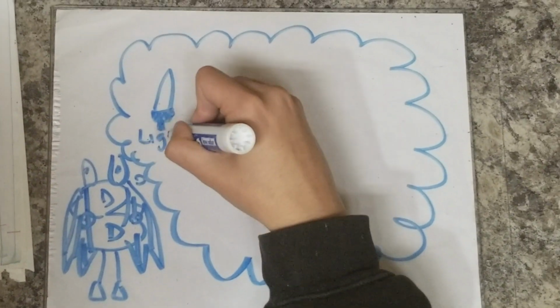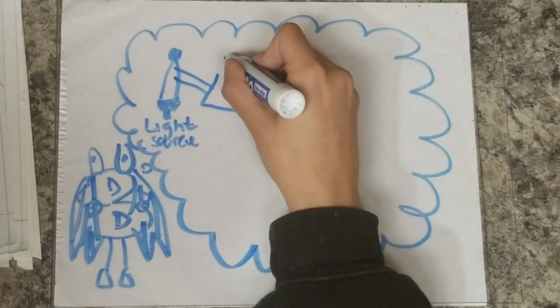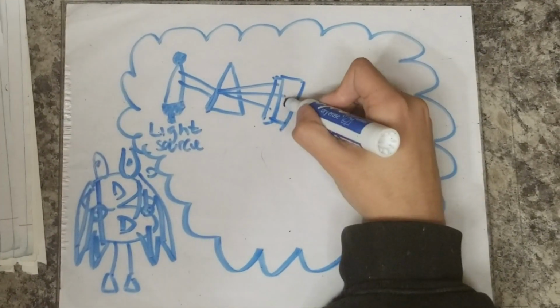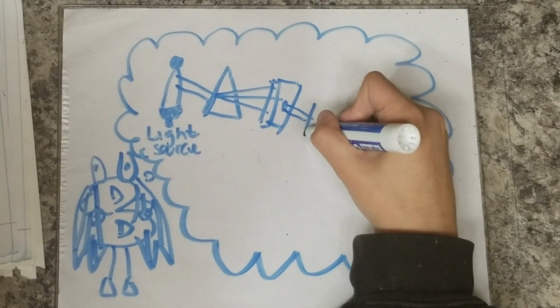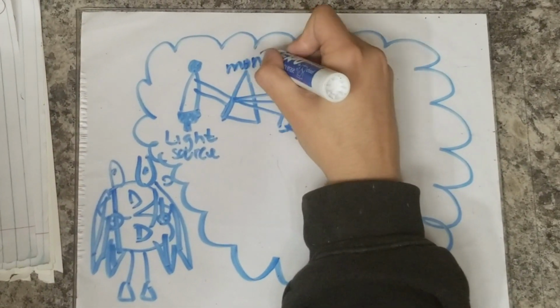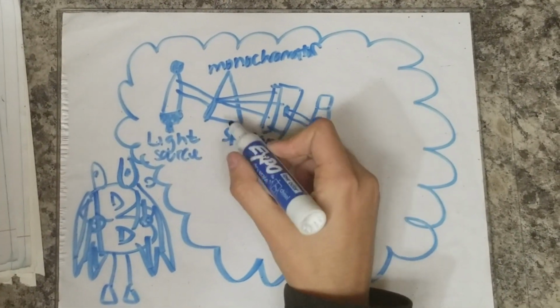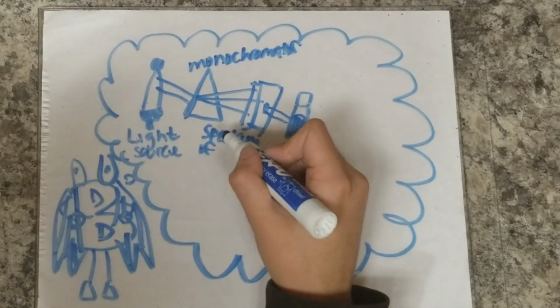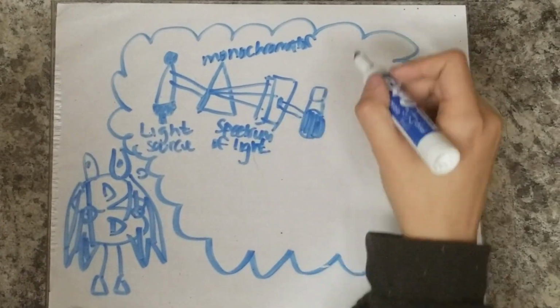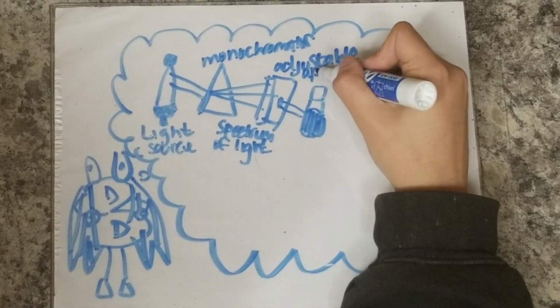Molecules have specific makeups, and because of them, they are able to absorb specific wavelengths of light. Spectrophotometers have a lamp that strikes light to a diffracting grating so that the light is separated into particular wavelengths, and these wavelengths interact with the molecules in the sample. A detector detects just how much the light interacts with the sample, and it displays its information in absorbance, or how much light the sample absorbs.